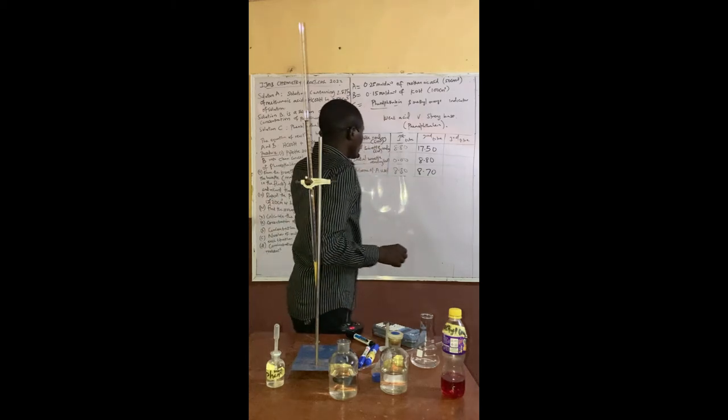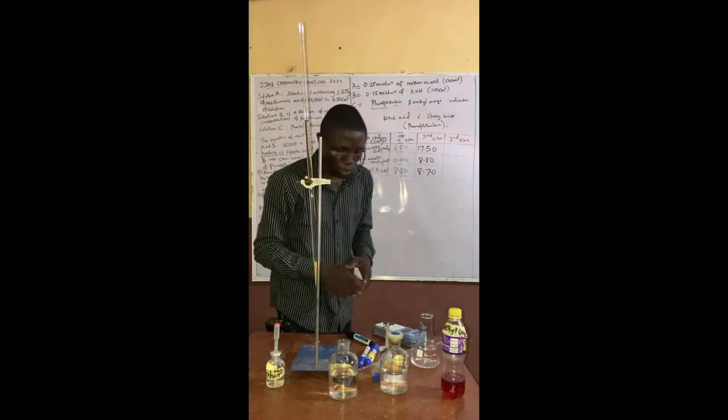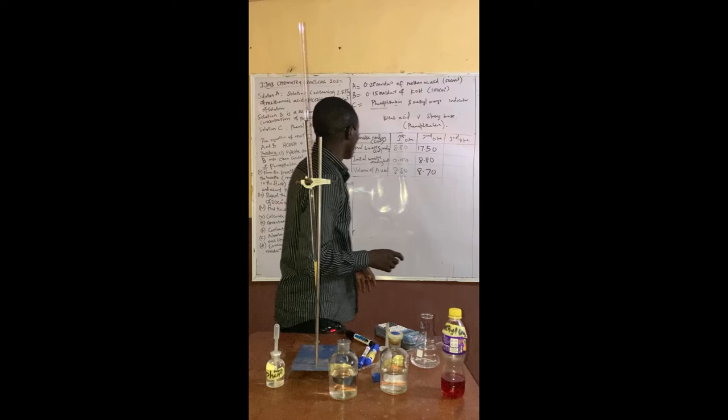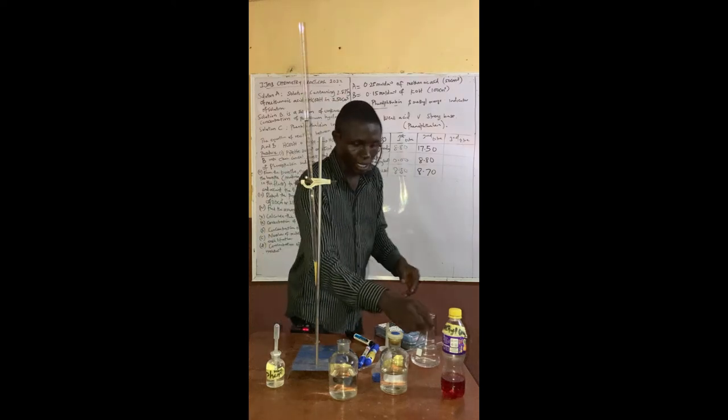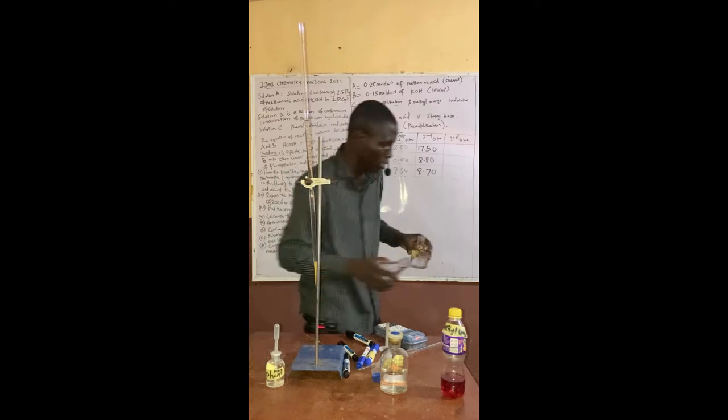So now, if that is the case, what is the next thing to do? We are going to carry out the third titration, which is the third analysis. So we also rinse with what?